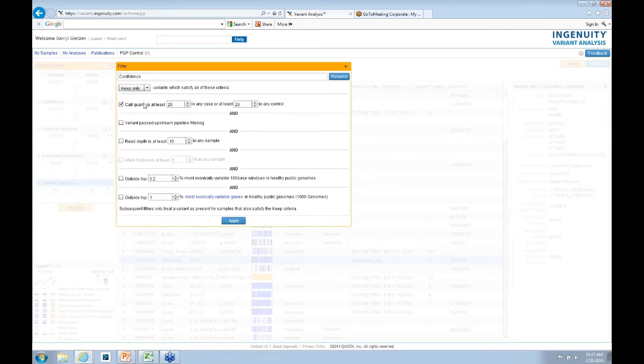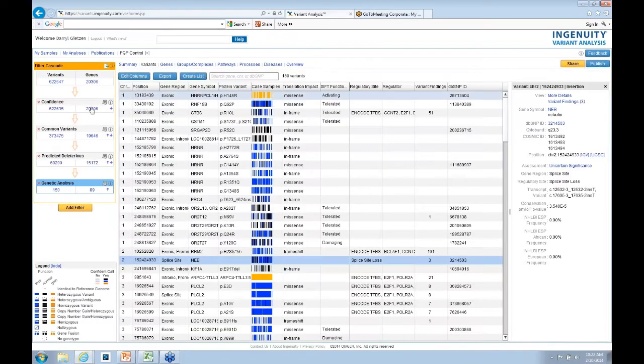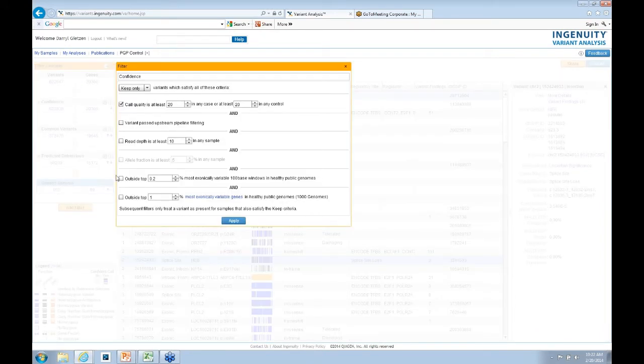Well, we have these noise filters down here, and I'm actually going to put this filter again. So this is something that you can do. I'm going to go ahead and close this up. I'm not going to implement it down here. I'm going to add another filter. I'm going to add another confidence filter down here at the bottom, and I'm going to add our noise filter.